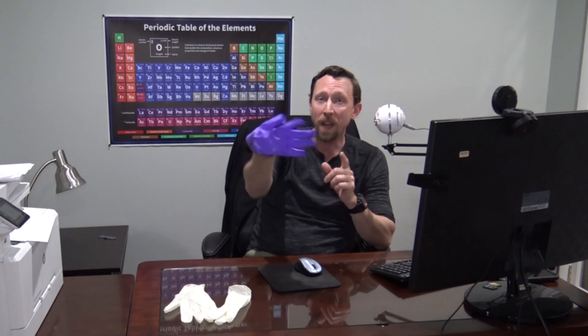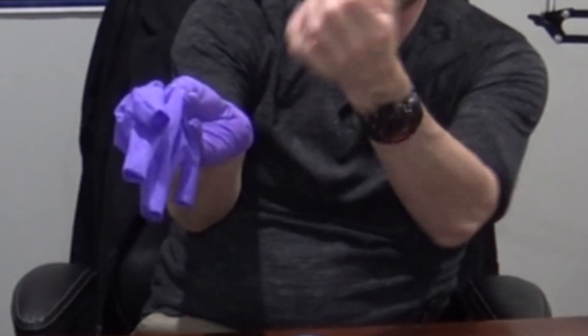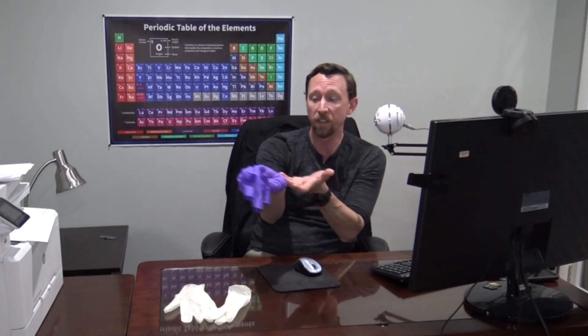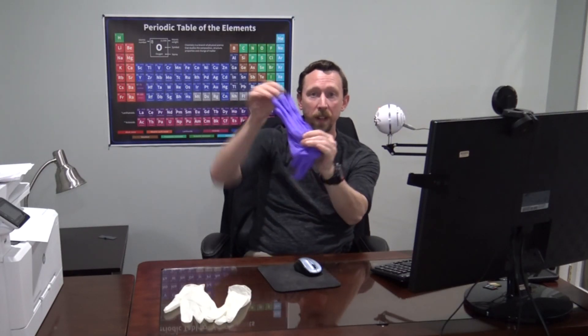But if I handle the second glove in exactly the same fashion, I'm touching the outside of my glove with the skin of my hand, potentially transferring contaminants. So to remove the second glove, I need to worm my fingers down underneath and invert it by pulling from the inside of that glove. Now my pair of gloves is completely inside out — inverted 100%. They're safe for me to handle from the outside. I can dispose of these in a responsible way and re-glove if necessary.